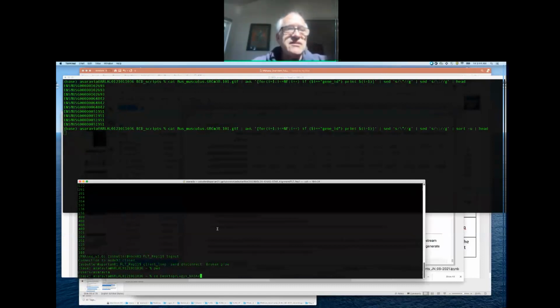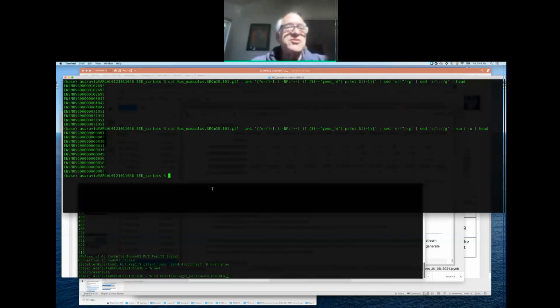Sed and awk, I believe, are the two most complicated commands that ever show up in this kind of line, which is probably why we don't go into them. It would take another day. But I urge everybody at some point to pick up the superpowers of knowing how to do sed and awk.